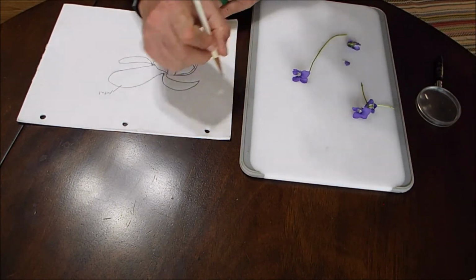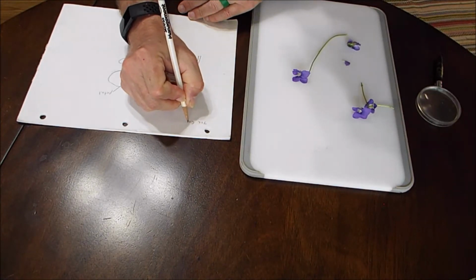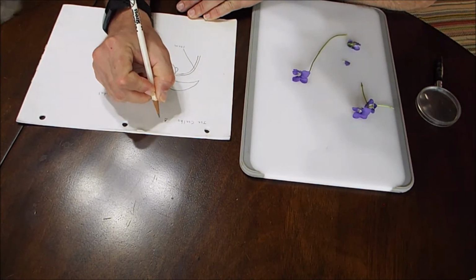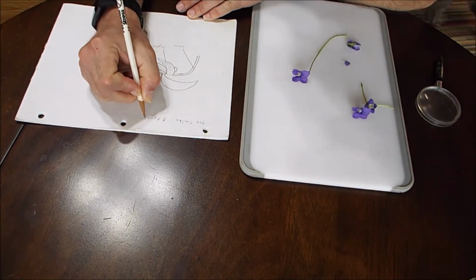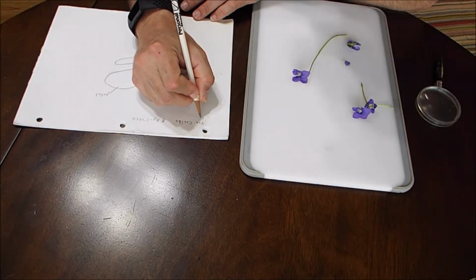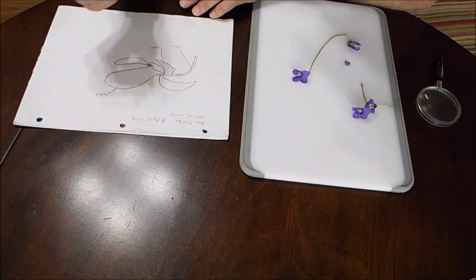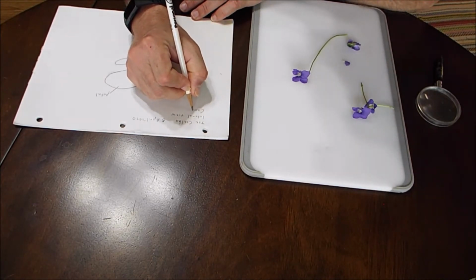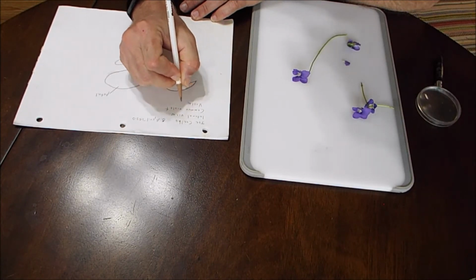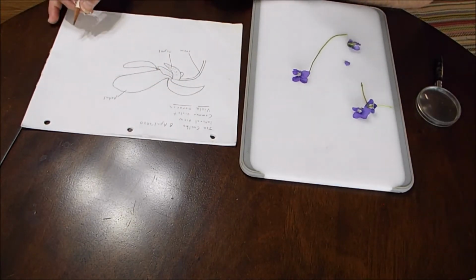We need to put, I'm going to put my name on it because I drew it. And today's date, which is 8 April 2020. And this is what I would call a lateral view, even though it's kind of an animal term, of common violet, Viola sororia, which should be underlined because that's a genus and a species.